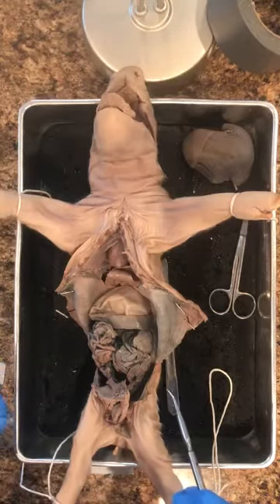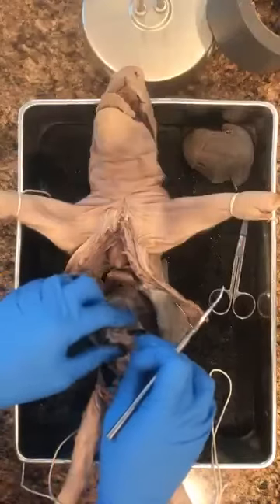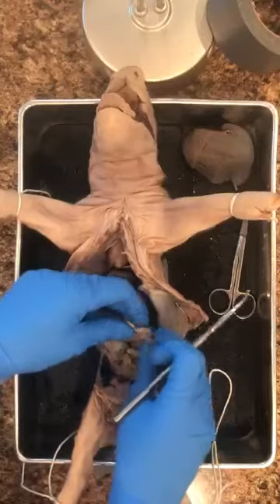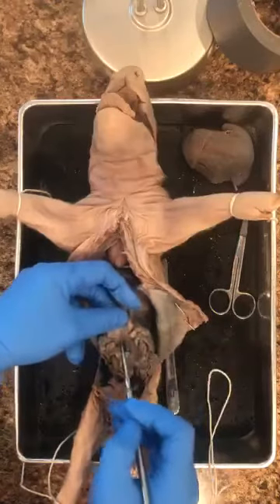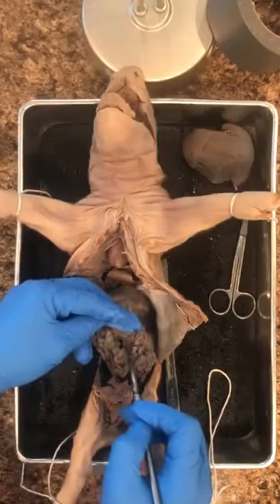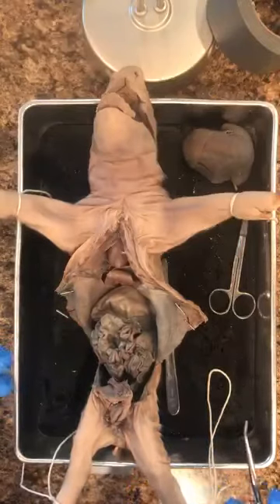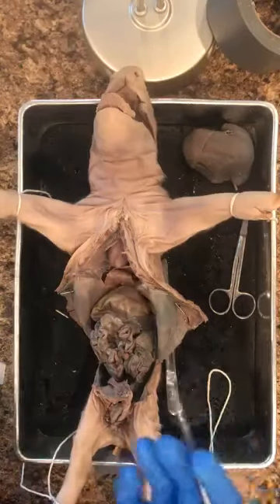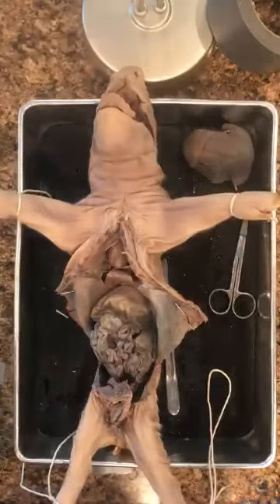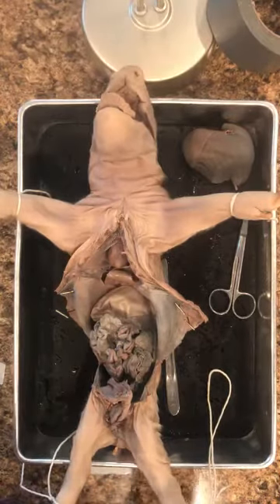And the thin mesentery, so the mesentery is that thin tissue, all this. So I'm going to actually remove these and cut them so you can see how long they are. But all this stuff right here, so this is the small intestine, and then all this stuff that keeps it connected is the mesentery. It is filled with a whole bunch of blood vessels that are going to absorb that and then take it to wherever it needs throughout the body. So ultimately the blood will carry the nutrients to the rest of the body.